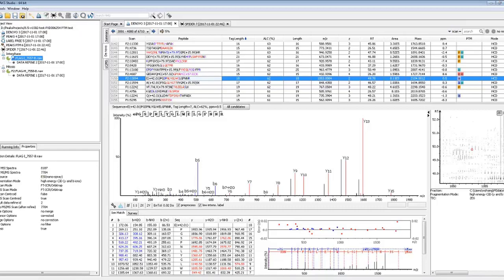We have a sample which was extracted from cells that were in the interphase of development, compared to cells that were taken from the mitosis phase of development. And the idea behind this search was we're trying to find the differences in PTMs, specifically focusing mainly on phosphorylation, trying to find differences in PTMs at different stages of the cell cycle.